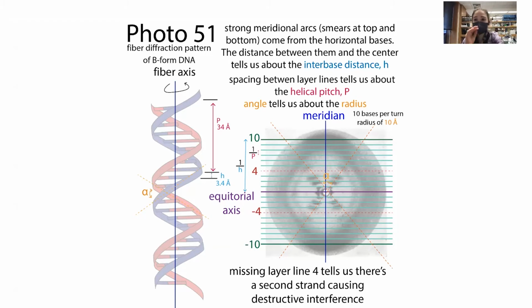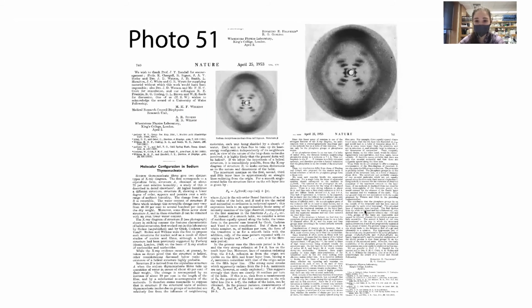But they all look pretty similar when you're hitting them straight on. The fact that we can see this tells us the signals aren't just canceling each other out, and so we get the signal at the top and at the bottom in these smears.